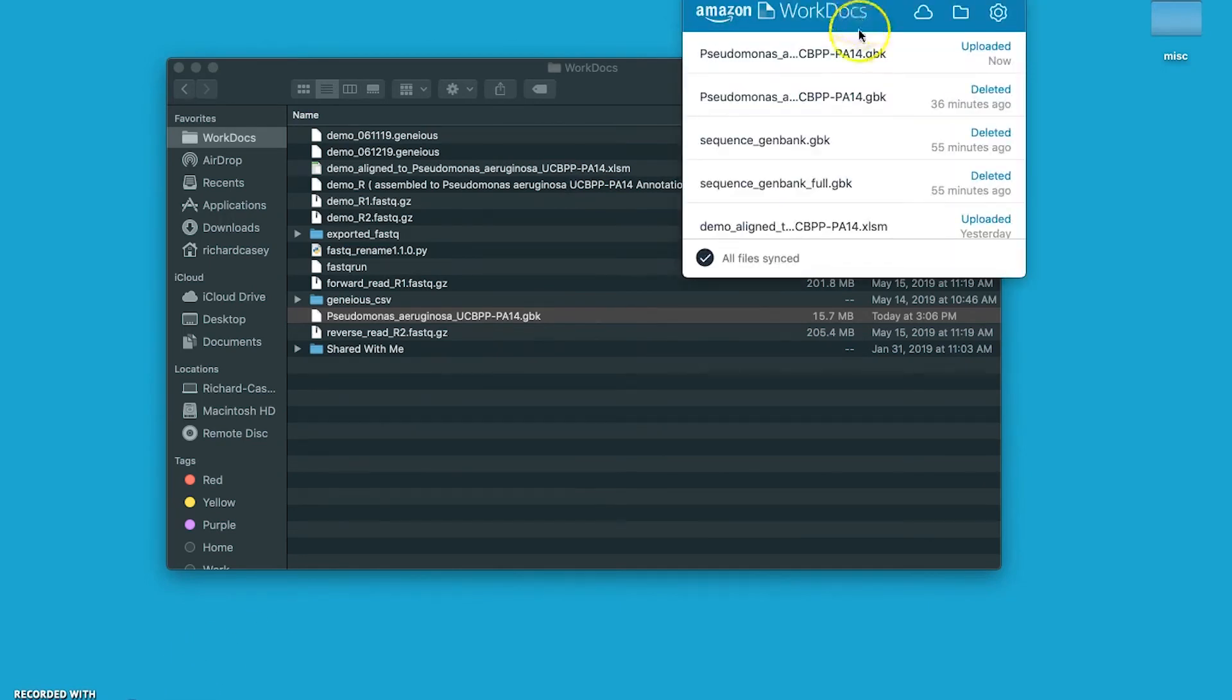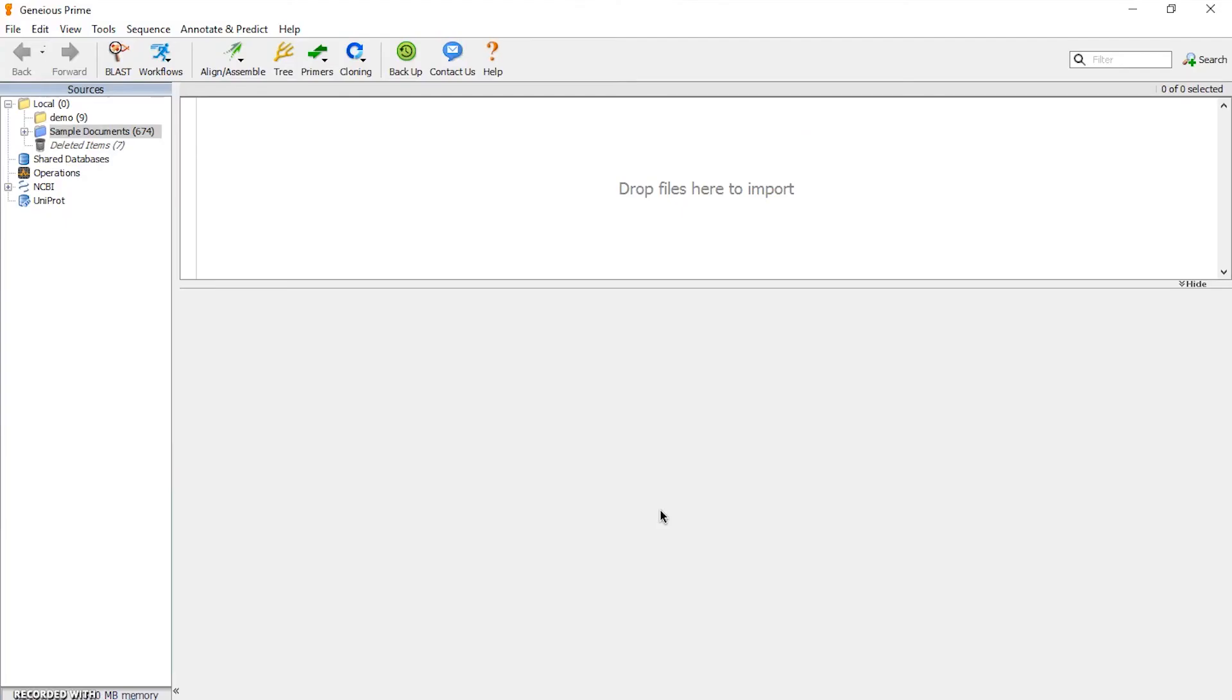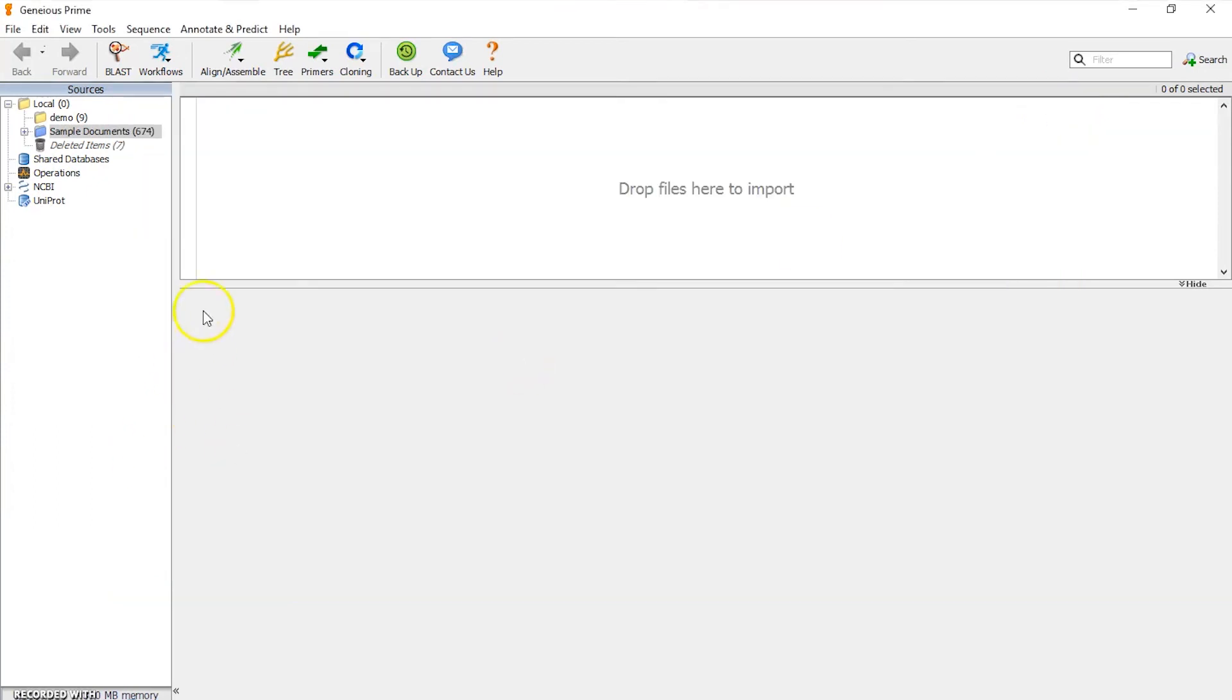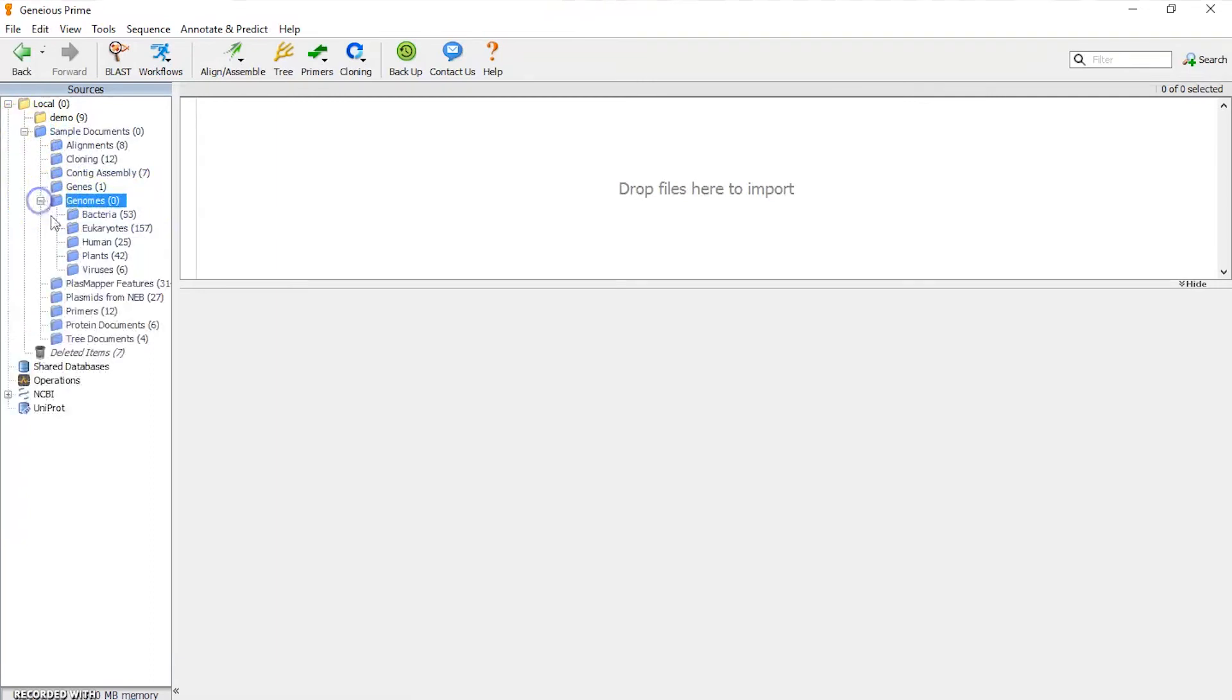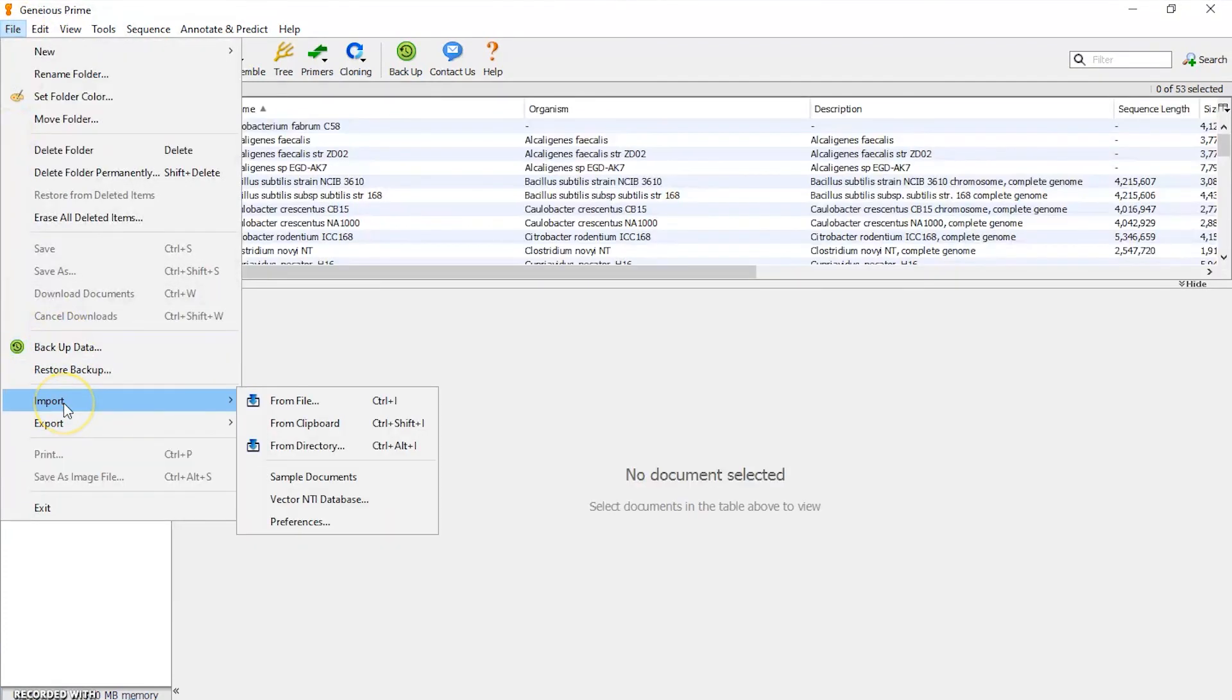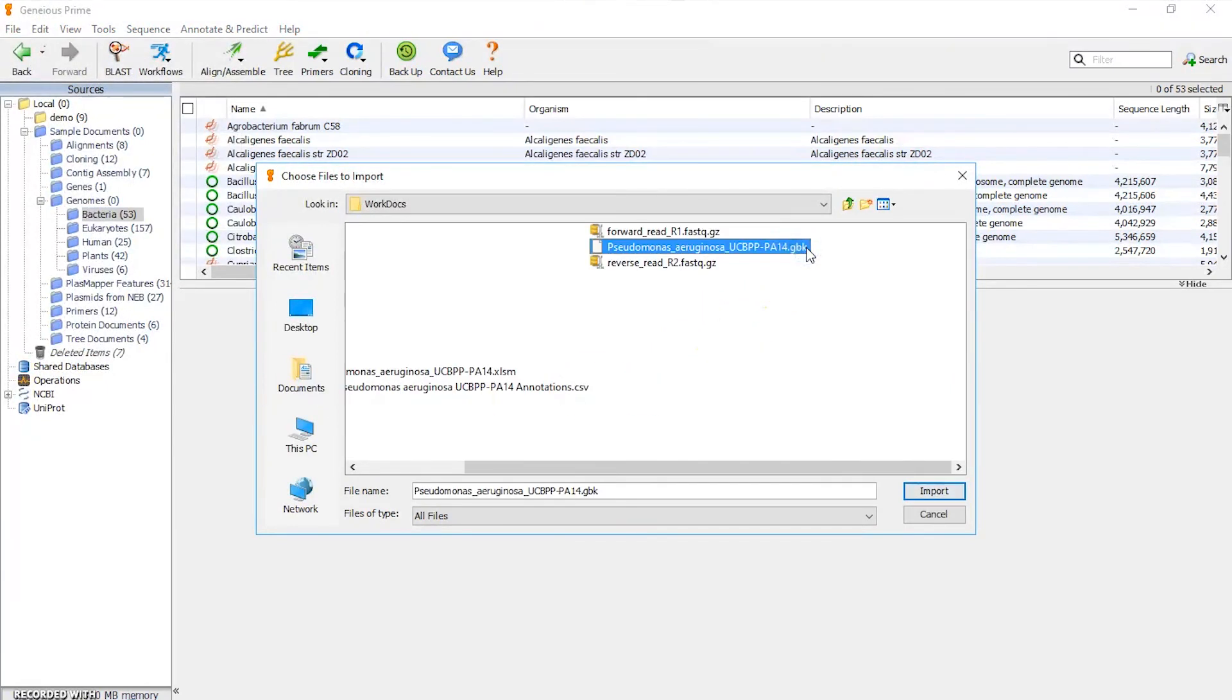So now we're going to log into AWS and look at Geneious. I've logged into AWS where we host Geneious Prime in our case, and I've already launched Geneious. We're in the Geneious screen. Actually, we'll take a quick look here on WorkDocs and we can see that our .gbk file has been uploaded to the cloud. What we want to do now is import the reference sequence into Geneious. In our case, we already have a directory set up called Sample Documents. If we drill down a little bit, we have another subdirectory called Genomes, and below that another one called Bacteria where we've already loaded a number of reference genomes. The way we do this is we just go to File > Import from File, find our .gbk file, and import it.